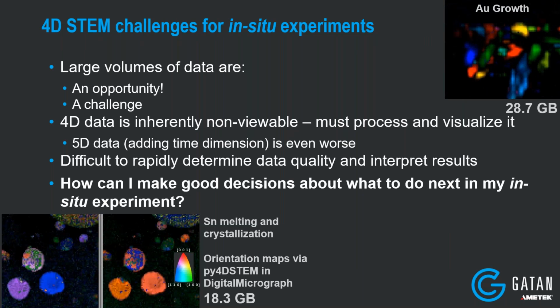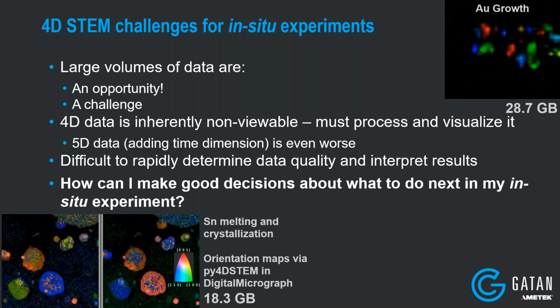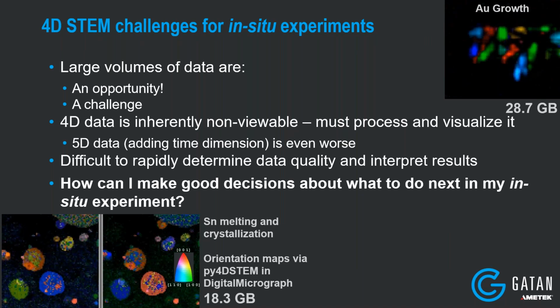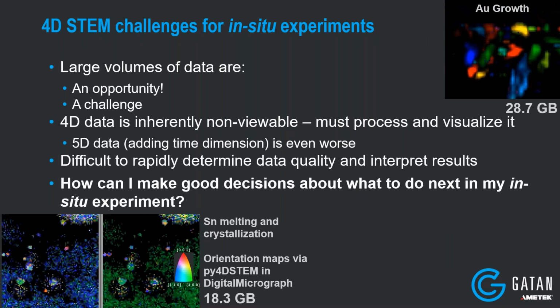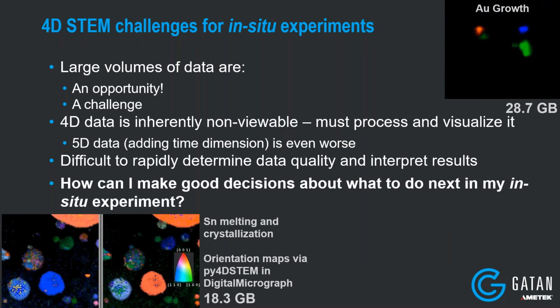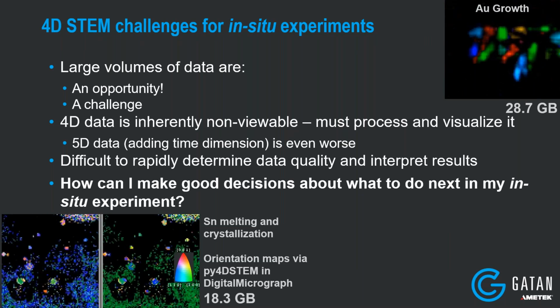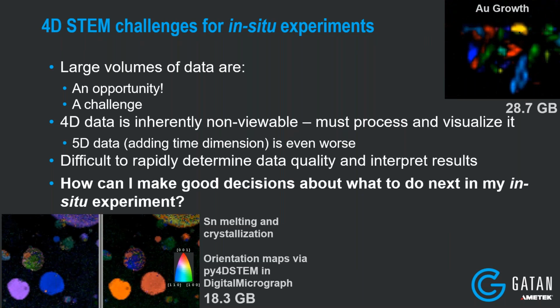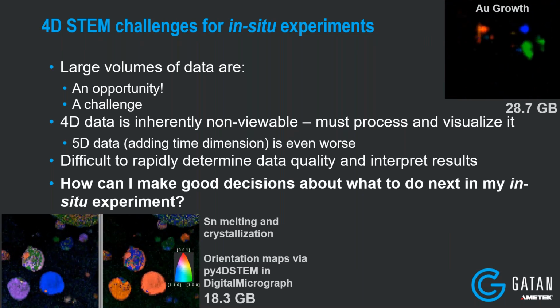in real time? And if not, does that mean I collect my data and then I have to go back next week and process it and visualize it, and then find out that my dynamics that I was expecting didn't happen. My transformation didn't occur. And so I'm going to have to go back and change my experimental parameters.